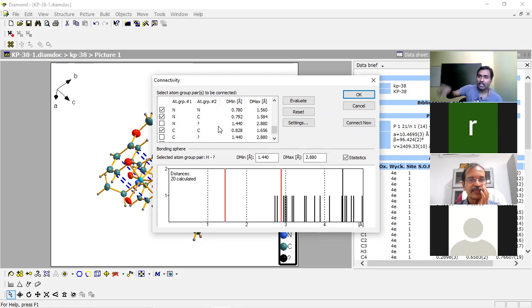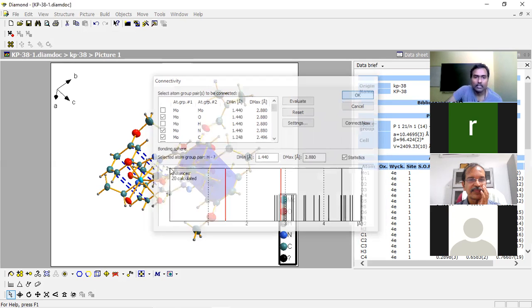Otherwise, it will bring the dummy atom and the related pi ring, so it will be very big. When you obtain a new molecule, this will disturb you, so you should remove it anyhow. Wherever the question mark is involved with another atom, we can uncheck those things. That is very essential, otherwise it will always disturb you. Make sure that you have removed everything, MOH also. Okay, now it is very clear.